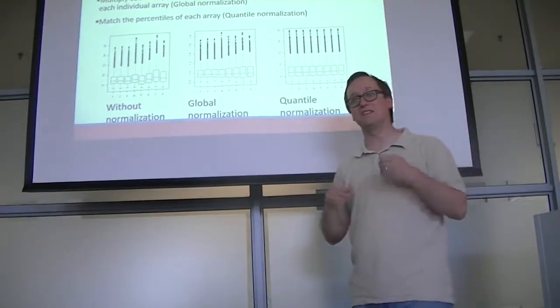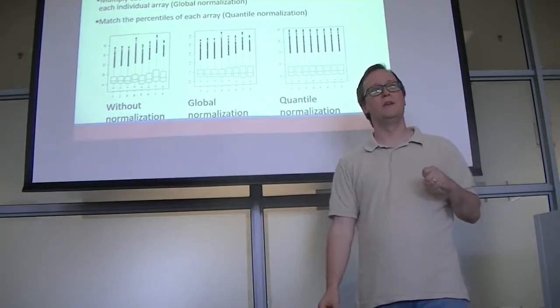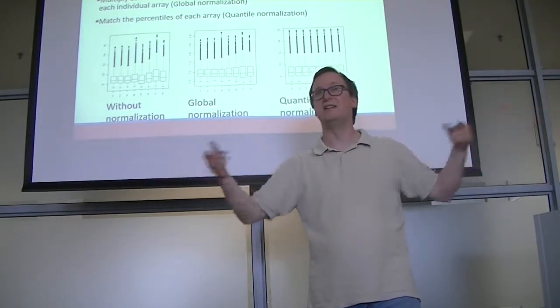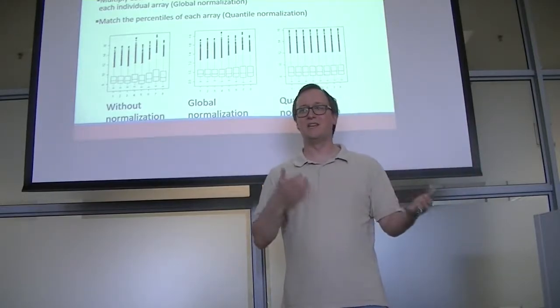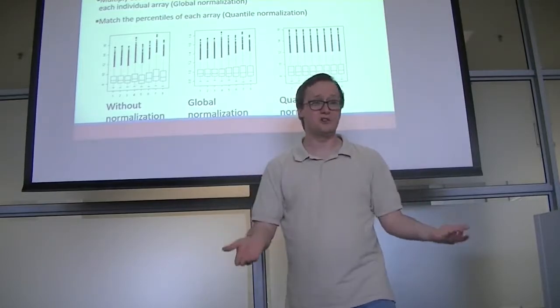You might ask, is it appropriate to use quantile normalization, or should I use global? If the cohorts differ in the breadth of expression profiles that they create, certainly using something like global normalization is going to be a lot safer for you than will quantile normalization. So which one is useful to you is going to depend upon how the data are distributed to begin with.